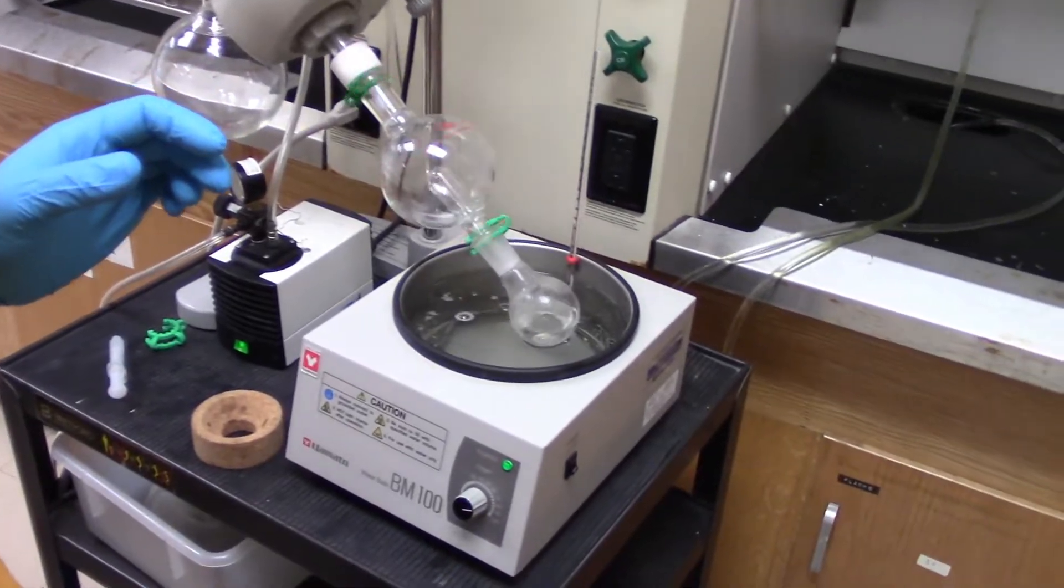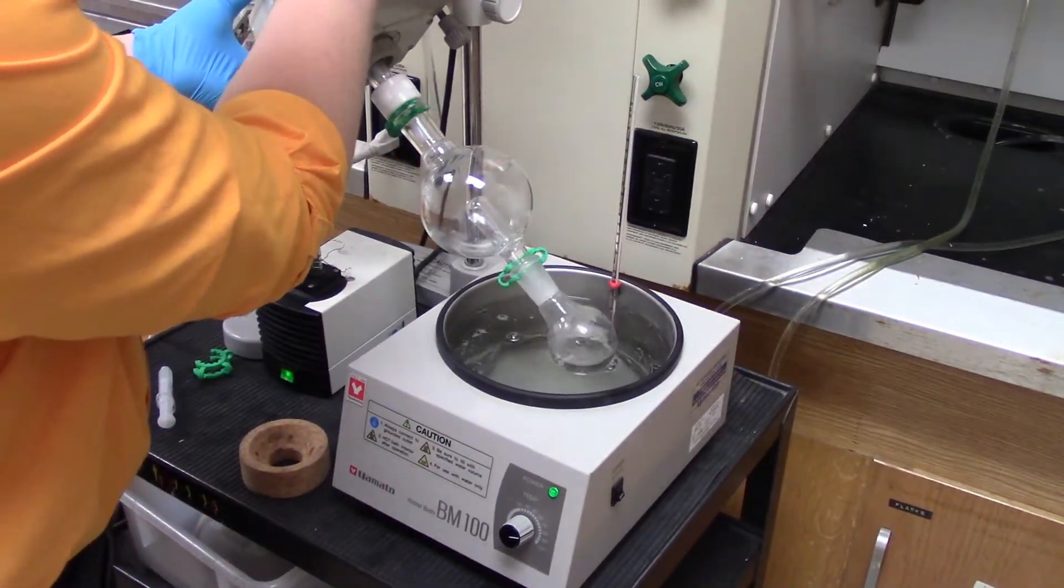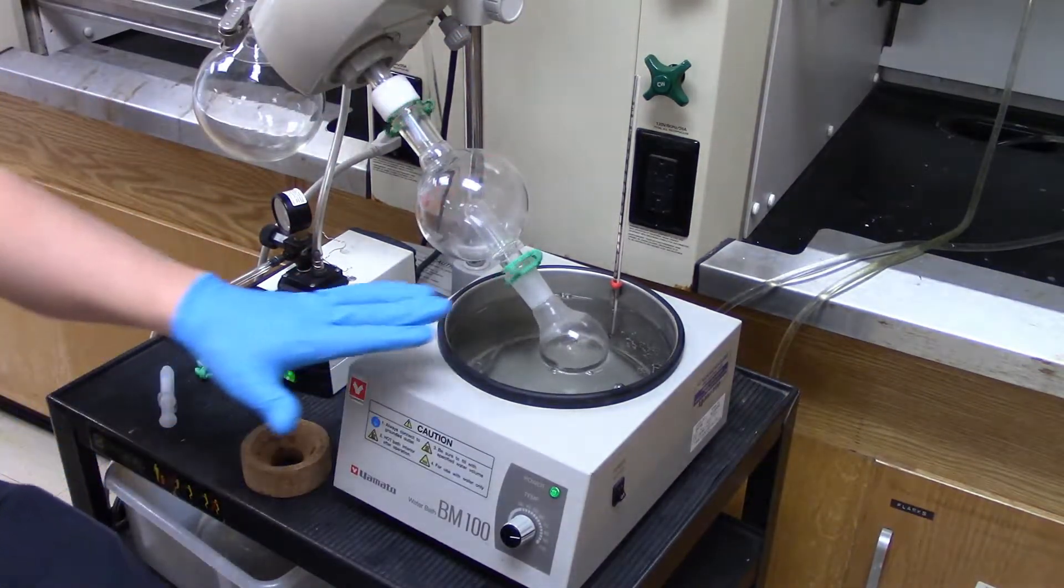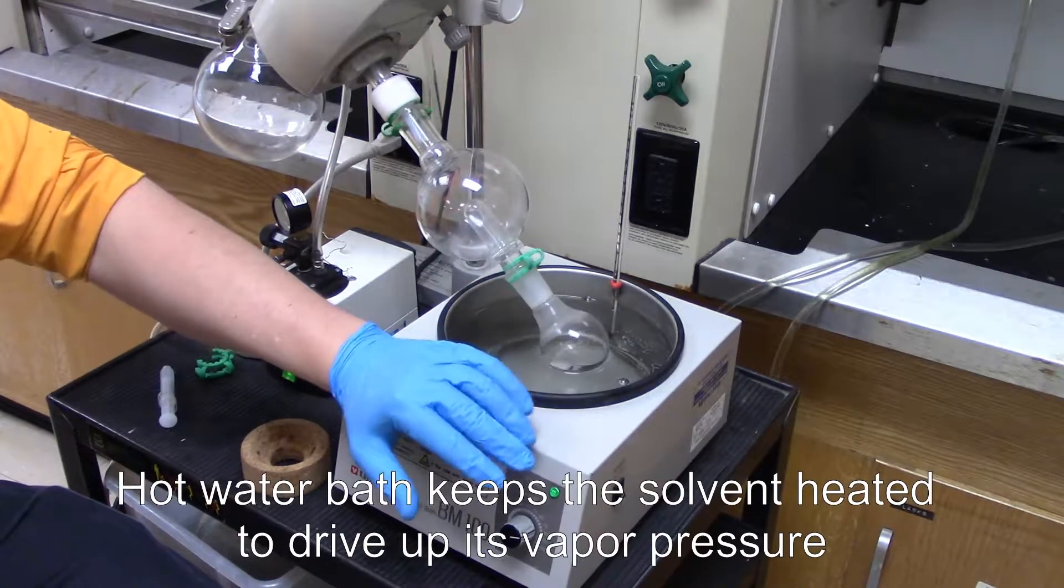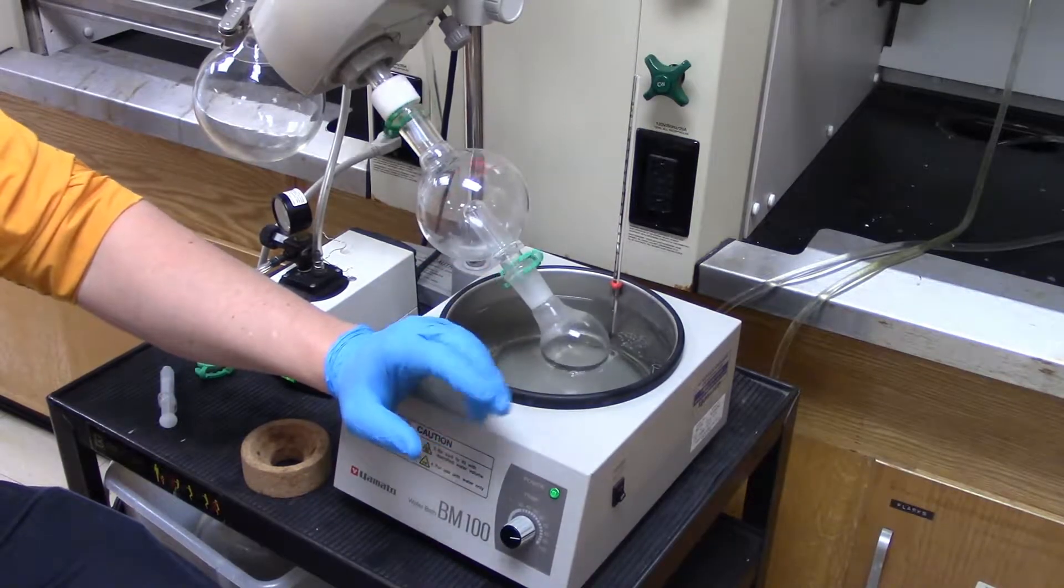Now, as this is running, what you'll notice is that this is circulating in a hot water bath. This puts four things in your favor when you try to remove the solvent. First thing it does is that it heats the material so this way it creates a high vapor pressure for the solvent that you're evaporating. So this won't work for something like water, but definitely a lot of organic solvents disappear quickly.